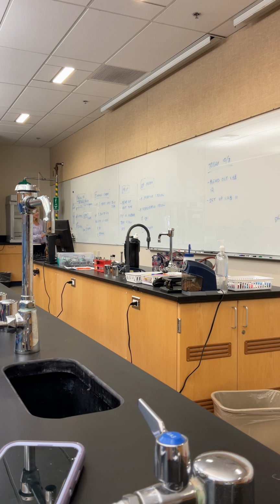The reason that this is important is, if I was to do a gram stain of E. coli, of Proteus, and of Pseudomonas, they all look identical. They're gram-negative rods, they're all teeny tiny, they all look the same.